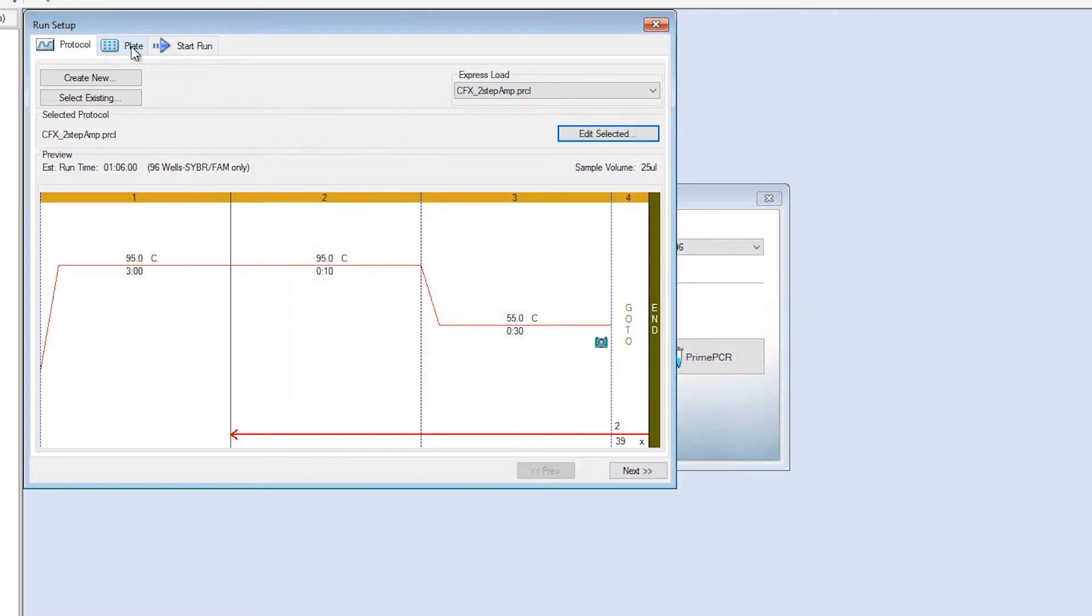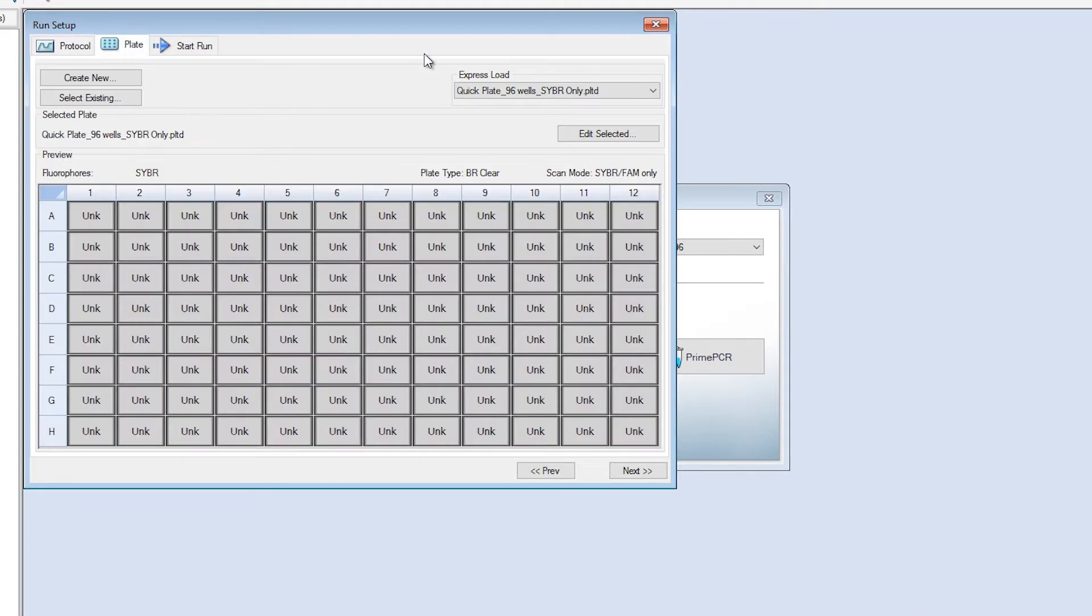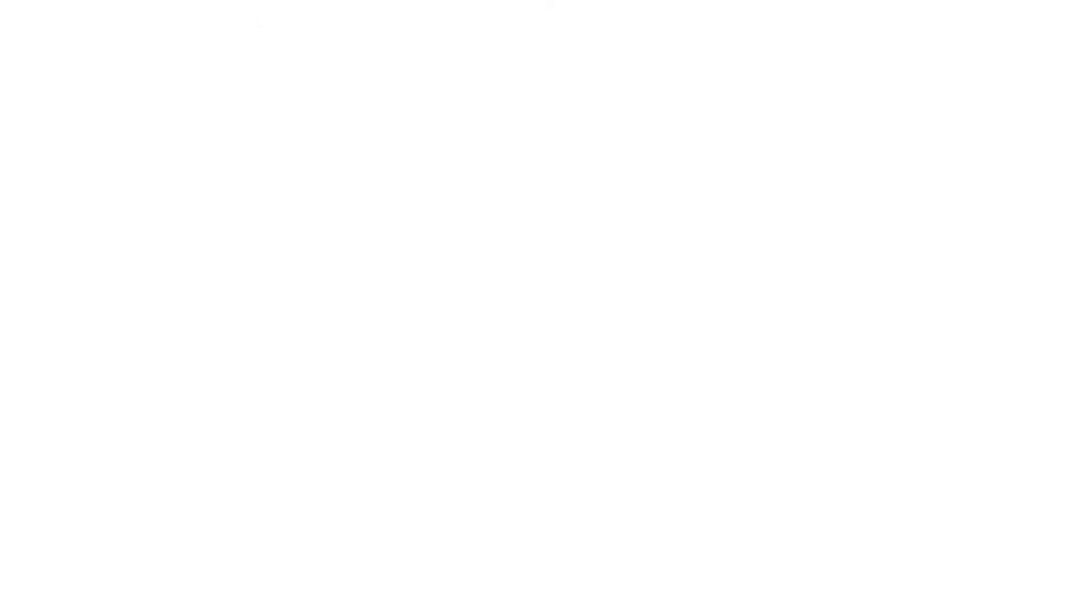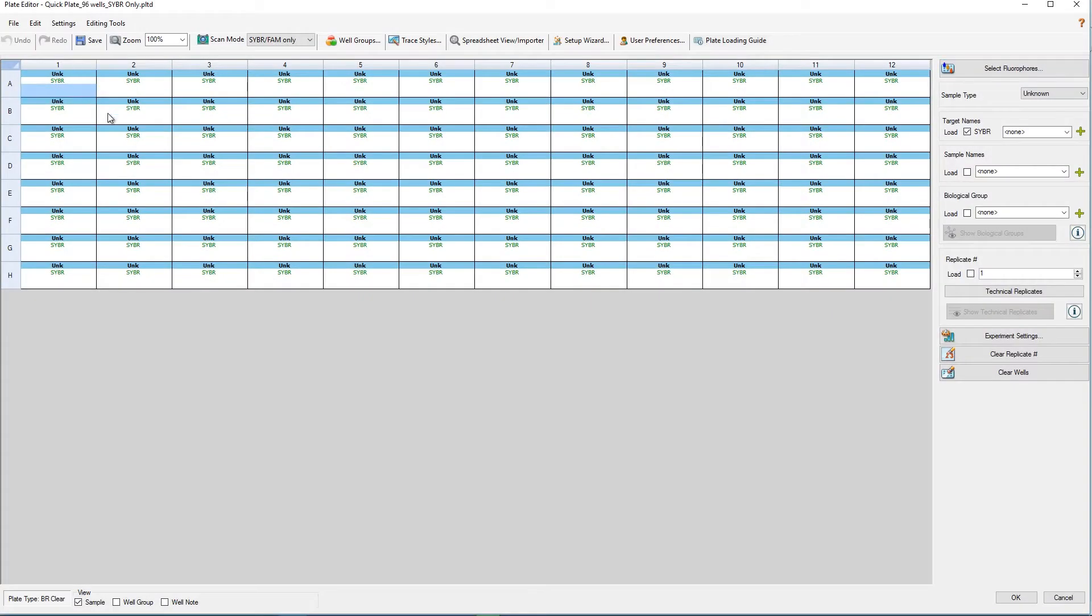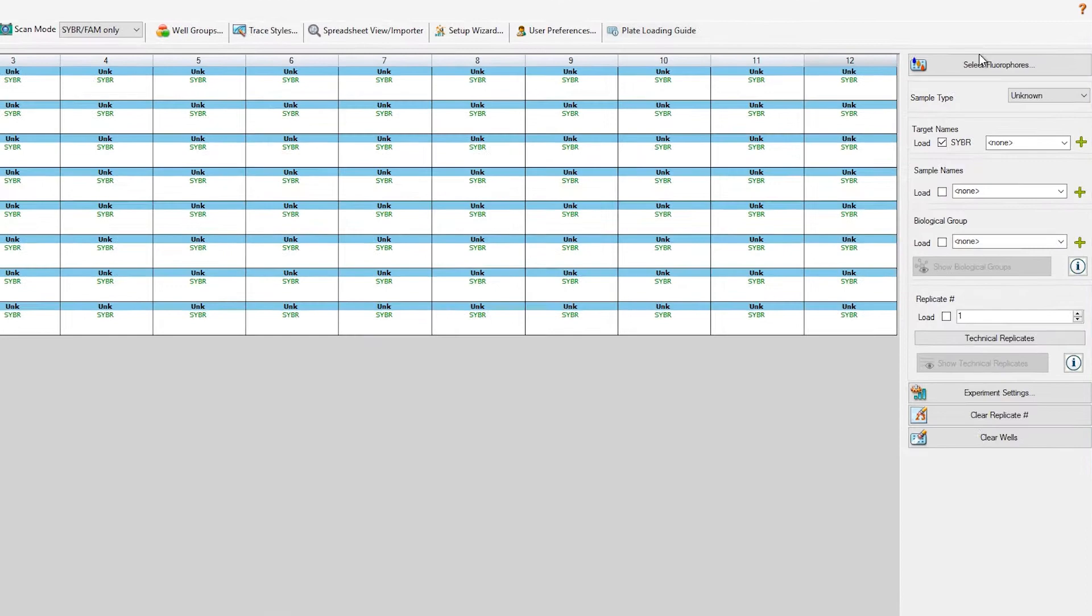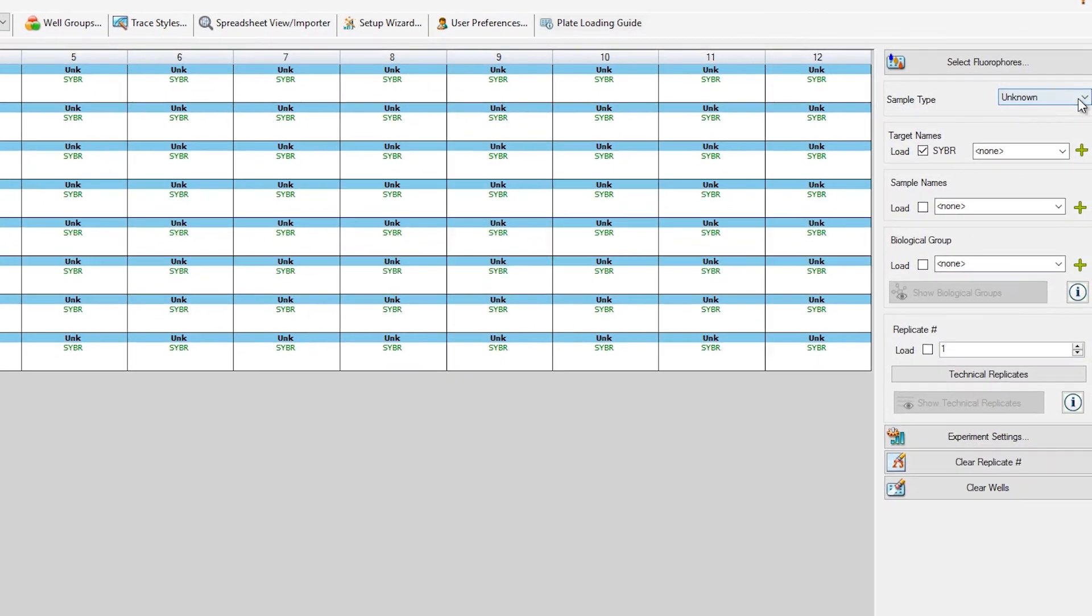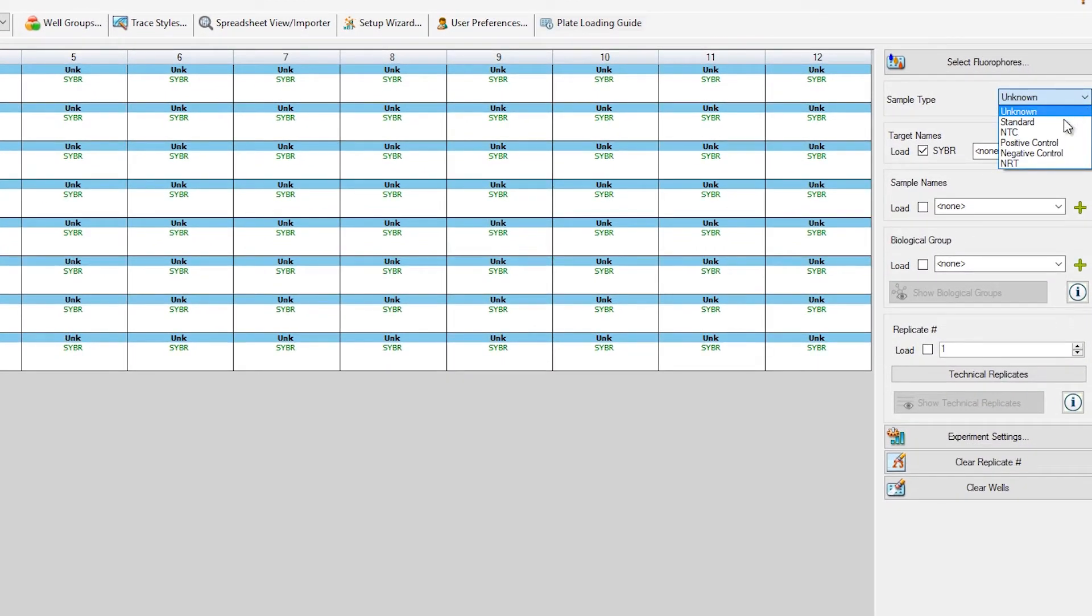Next, I'll move on to designing the plate layout. You can easily select multiple wells at once by clicking and dragging over them. Here, you can choose your sample type, which can be unknown, standard, or control.